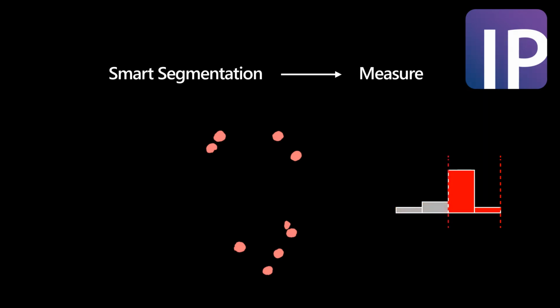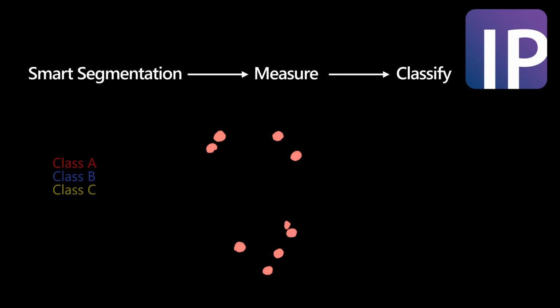In either method, the ranges set can be used to filter the population of objects based on the measurement requirements. Should some objects need to be excluded from the selection, filter ranges can be easily set based on shape, size, color, and intensity. Further refining the specificity of the filtered results to the original objects of interest is done to optimize the results.